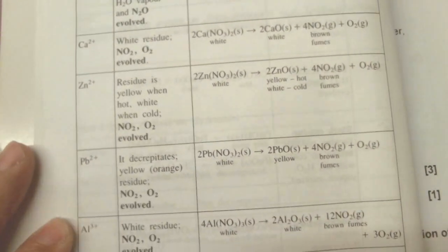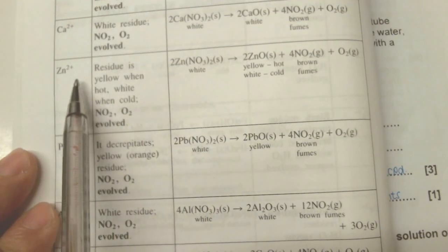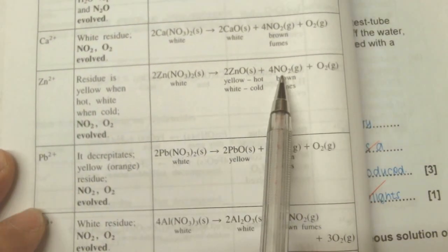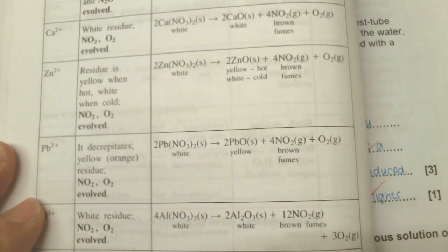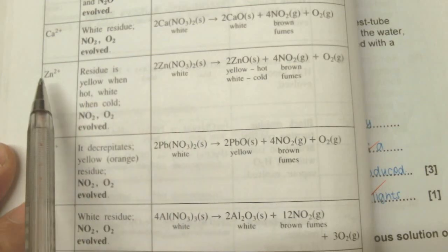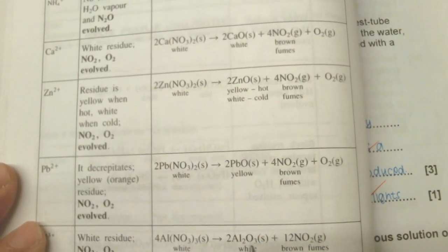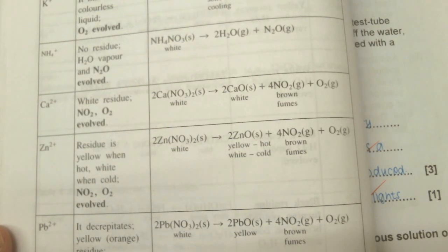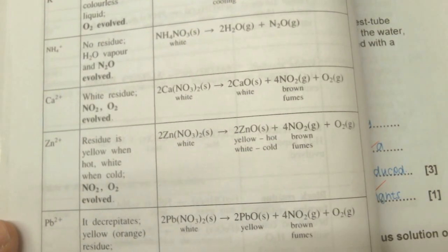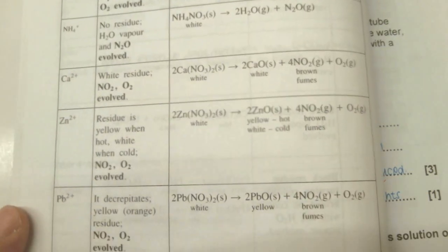You will find that what you have seen over there is very familiar, and it must be a nitrate, because only a nitrate gives off brown gas and oxygen gas. Now when you look at this reference over here, if the solid T is zinc nitrate, you will get this observation. So from here, you can roughly say that it could be aluminium nitrate or calcium nitrate, would you? So we deduce more with a little part of the experiment.